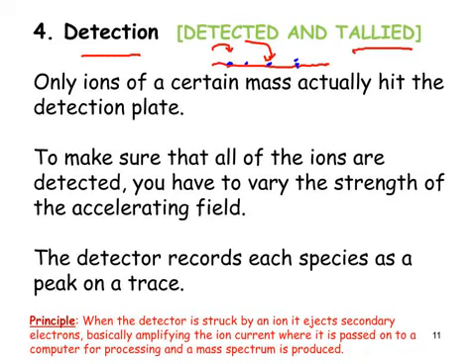So a second one comes in here, one comes in here for the first time, another one comes in there, another one comes in here, and so on, and we're literally getting a tally as they strike the detector.